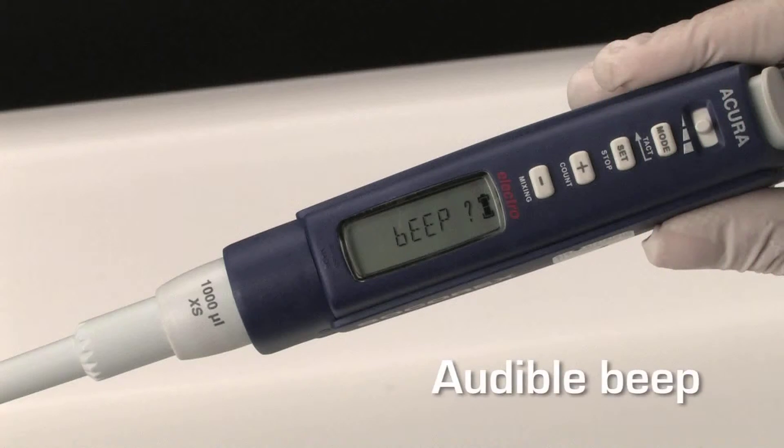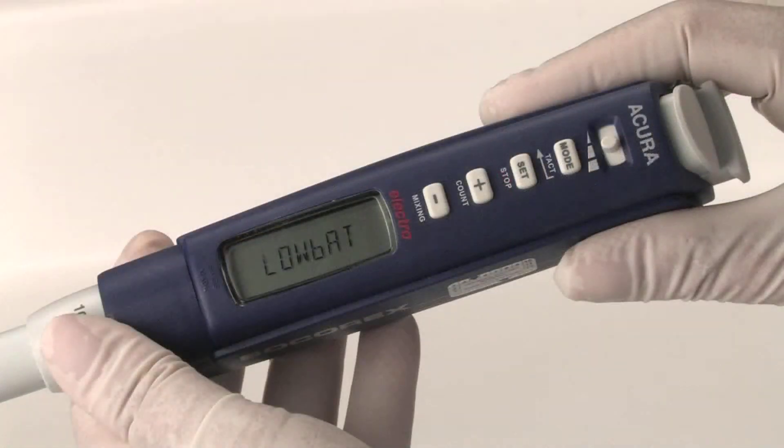The audible key beep can be turned off any time. The battery indicator will display power level. When low battery is displayed, the pipet needs to be charged or the battery changed.